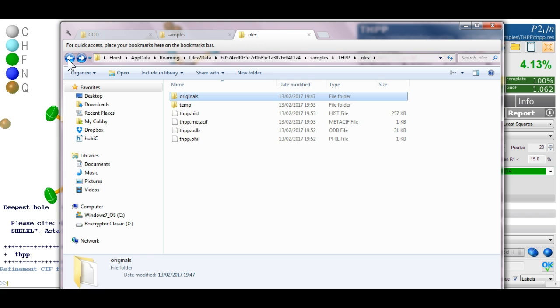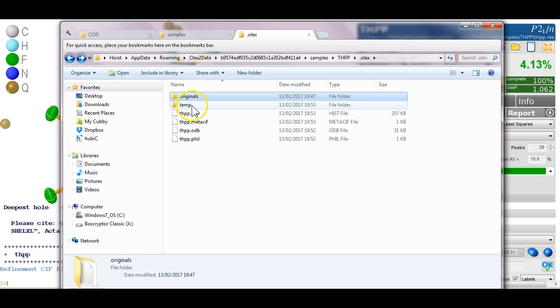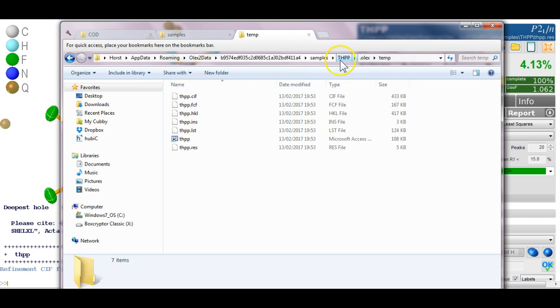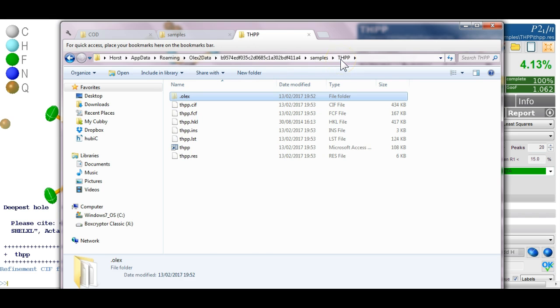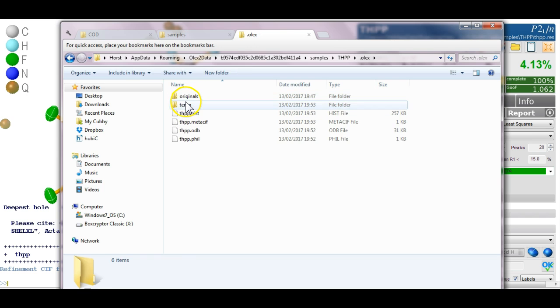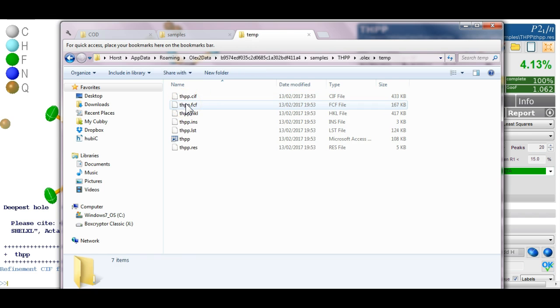It also contains a temp directory and that temp directory, this is where the actual ShellXL refinement happens. So what Olex 2 does it copies the necessary files from the top directory into the temp directory and then starts the ShellXL refinement process in this directory.